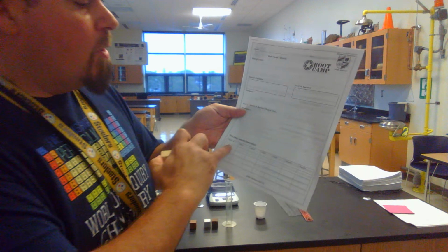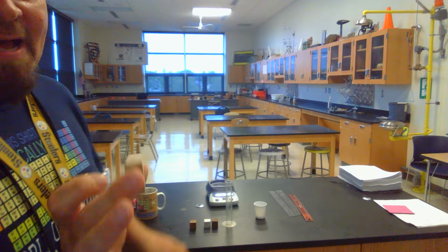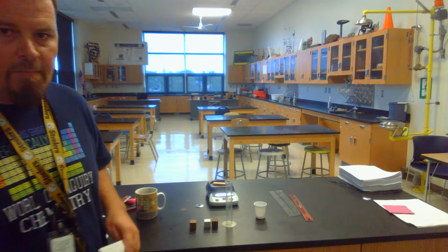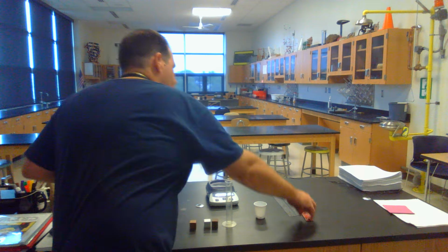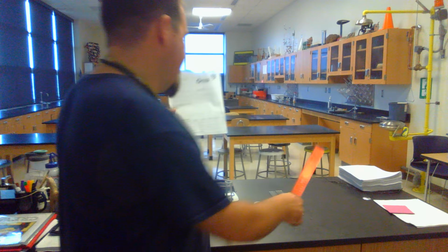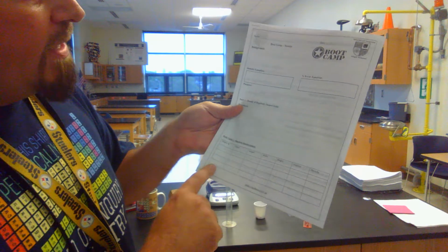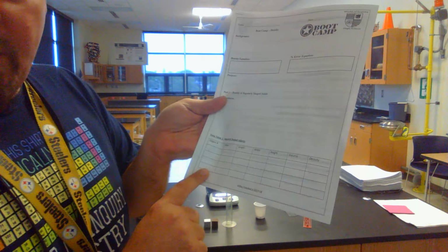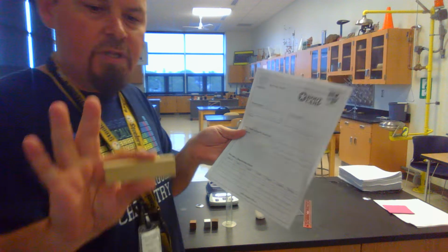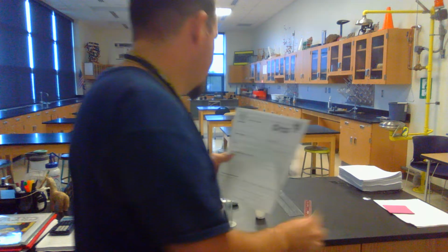So I want you to write your lab partner's name here, and then they're going to mass the Jenga block using the balance. Bam. Write down the mass. Then they're going to use a ruler to measure length, width, height. Okay, and then you're going to calculate the volume. From there, you can do the density. Then down here, how about we put in average? And you guys average your densities and give me an average density for the known regularly shaped object. Okay? Okay, good.